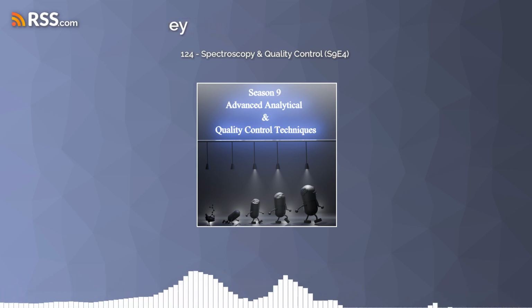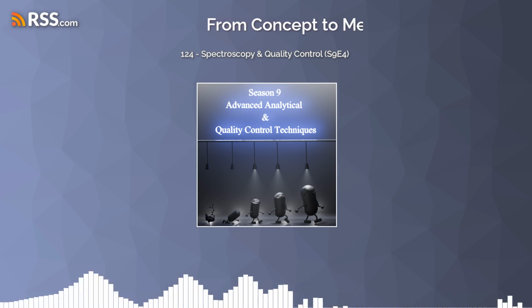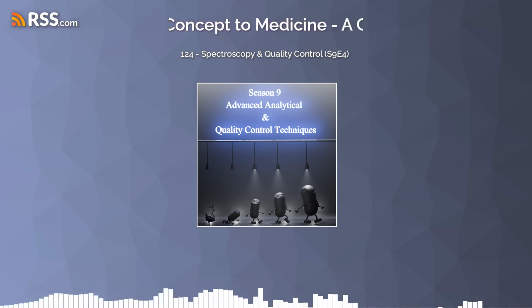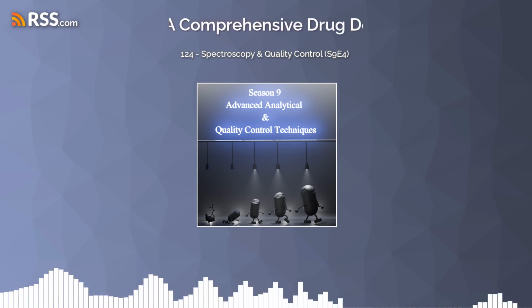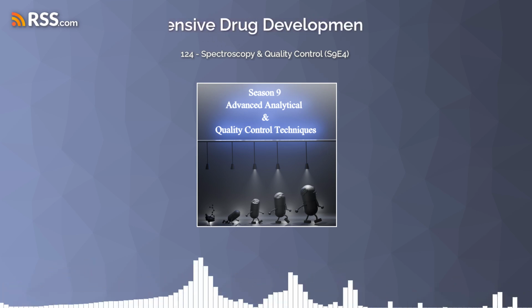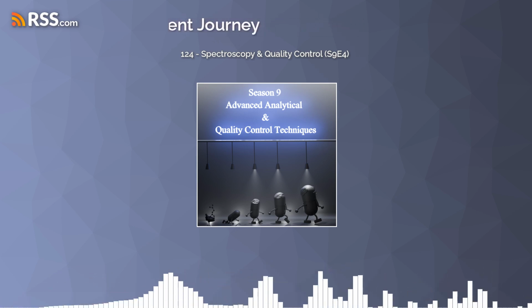So it's like you're tuning into a radio station, but the radio station is a specific atom in the molecule. Exactly. And it's telling you something about its environment. It's like a little radio transmitter inside the molecule, giving us information about what's around it. And from that, you can get a feel for the connectivity, like how are all these atoms connected?